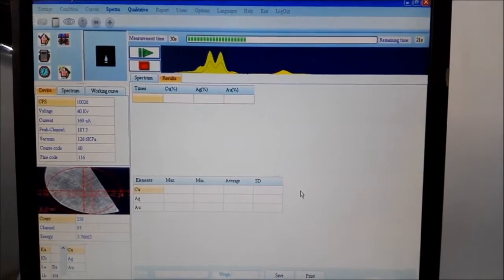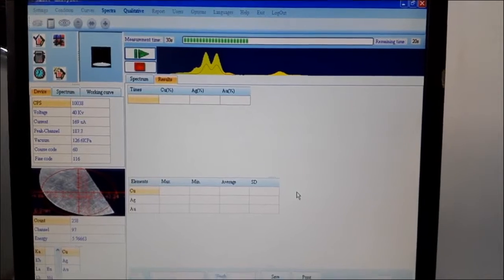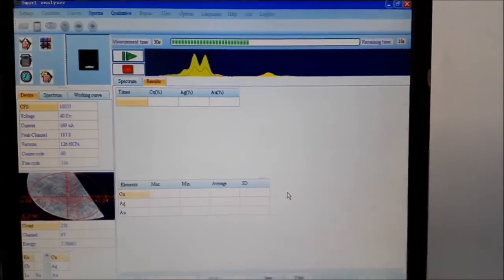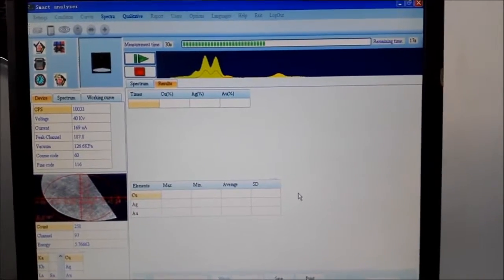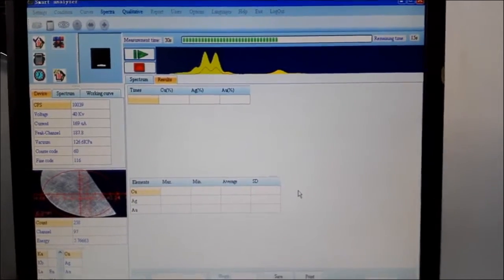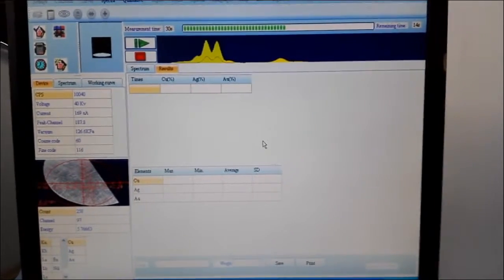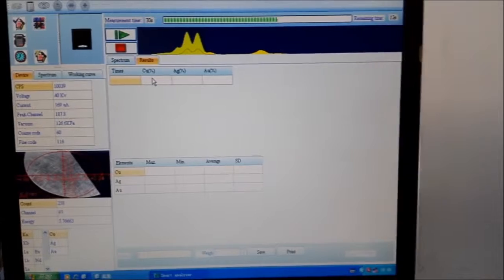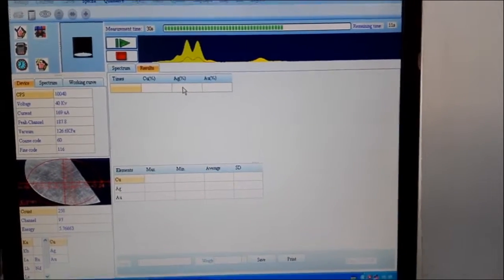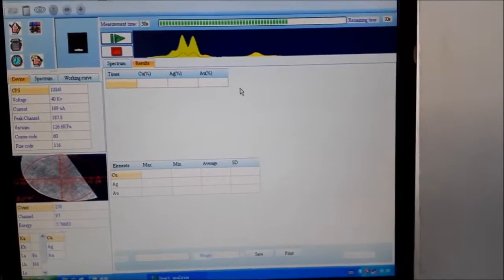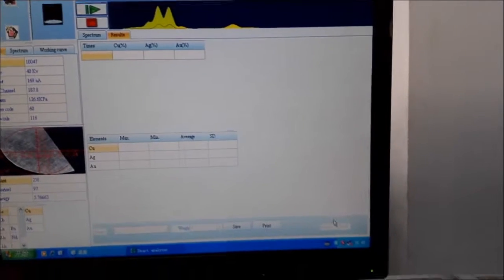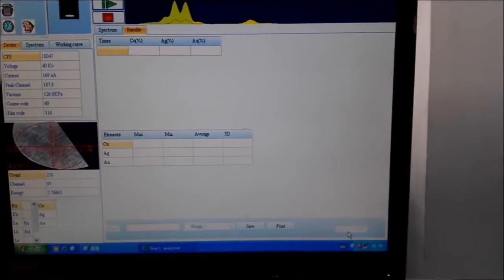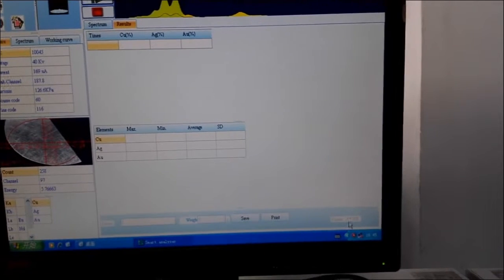We will see the result. We can get the concentration of the copper and silver and gold as well. And we will check, we will see the carat value of your gold here.